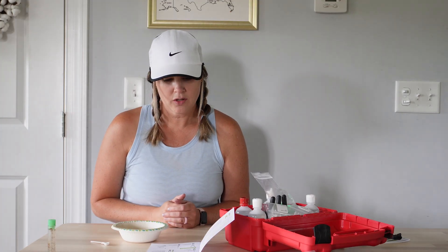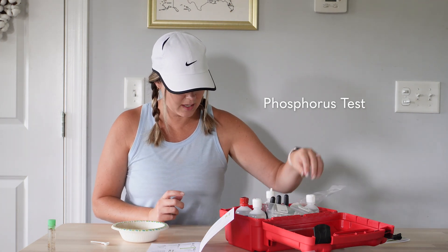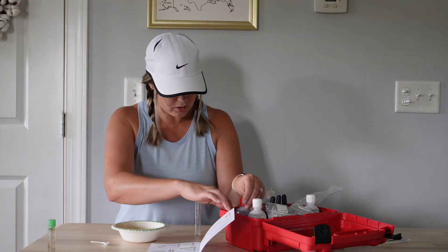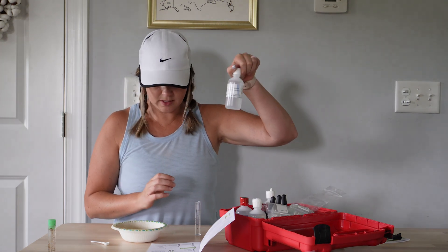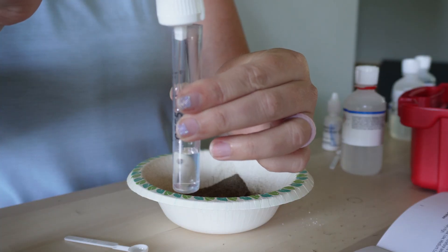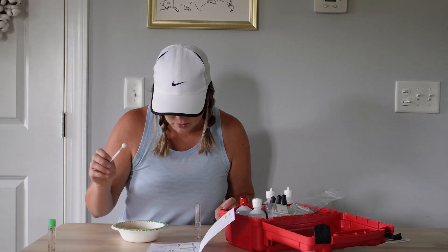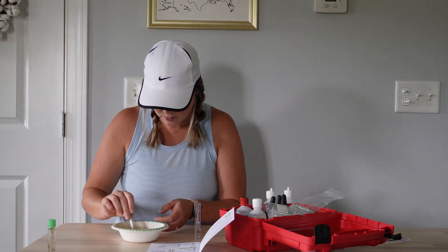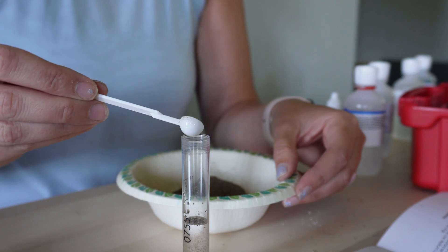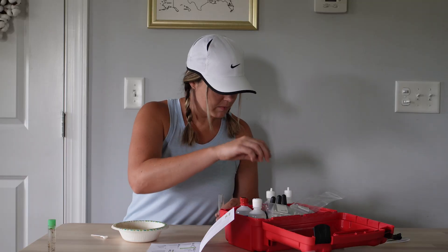Now we're going to move on to the phosphorus test. We're going to take a test tube and fill it to six milliliters with phosphorus extracting solution. Use the same spoon, add three measures of soil sample. Cap and mix gently.